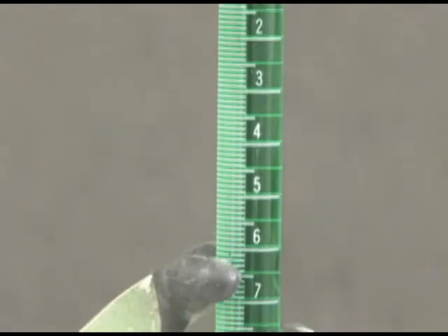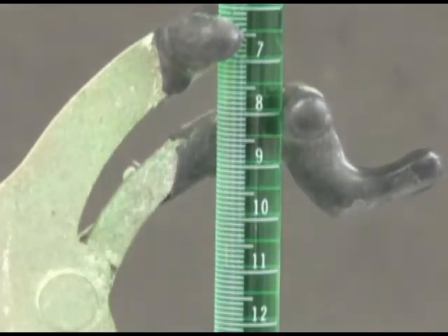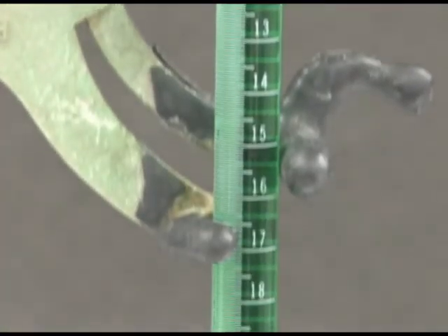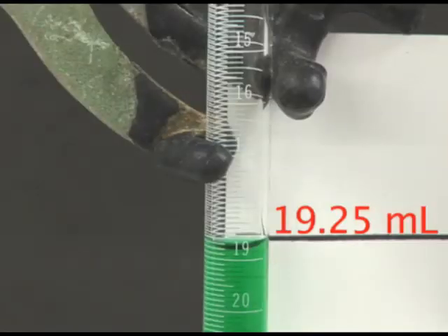To read the volume delivered by the burett, remember that volume marks increase down the burett. For example, the volume reads 19.25 milliliters.